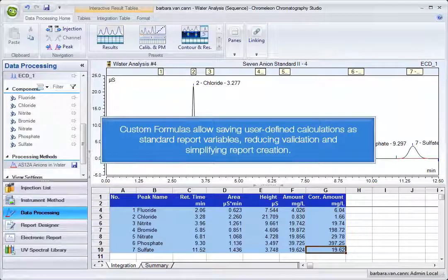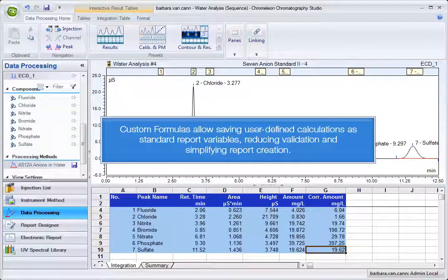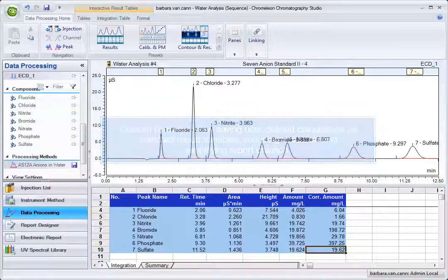Custom formulas allow saving user-defined calculations as standard report variables, reducing validation and simplifying report creation.